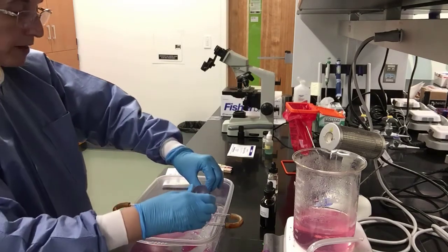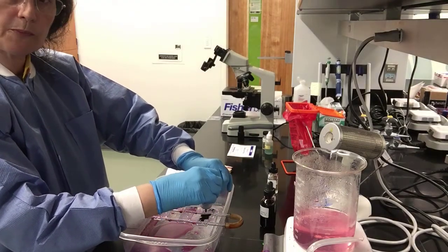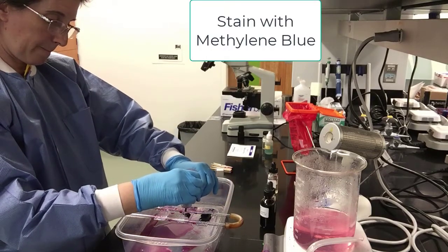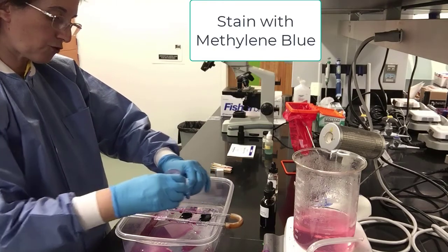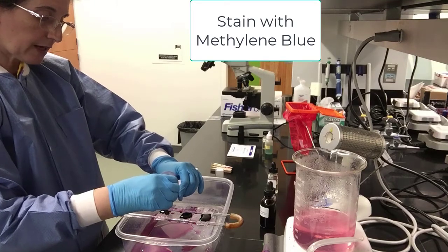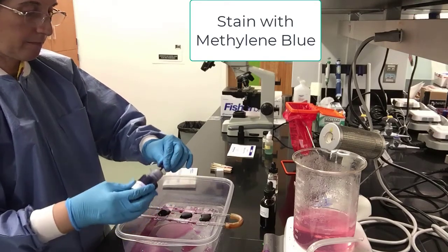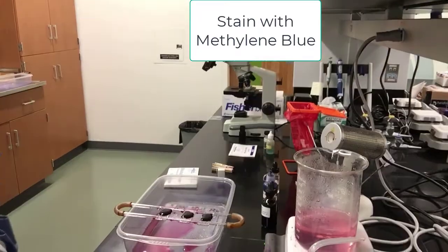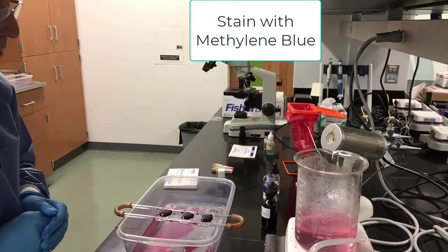Now remember, the methylene blue will stain only those bacteria that are acid-fast negative. The ones that are acid-fast positive have absorbed the carbolfuchsin and will remain red. We flood the slides with methylene blue very generously. Just flood the whole specimen. And then we allow the methylene blue to sit for 2 minutes. 2 minutes have gone by.